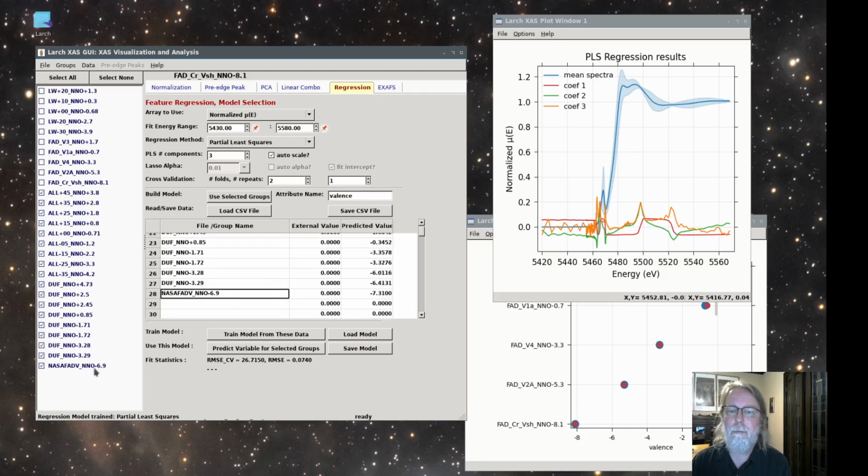For the most reduced end member of the set, since this also has FAD, so that's actually a similar composition sample, and its fugacity range was in the same range as the training set. Actually, it does a pretty good job on that one. Again, -6.9 is predicted to be -7.3, which is sort of within our acceptable uncertainty of something like 1/2 to 1 log units of fugacity.